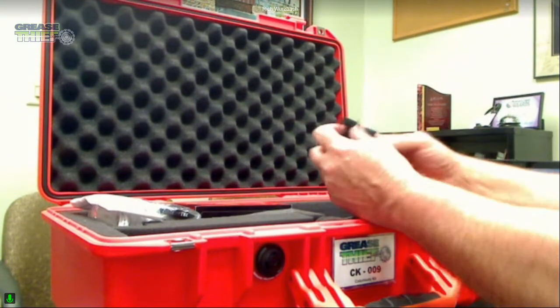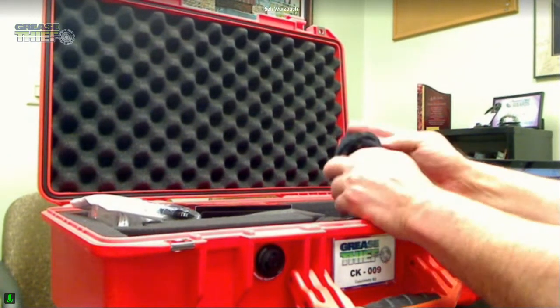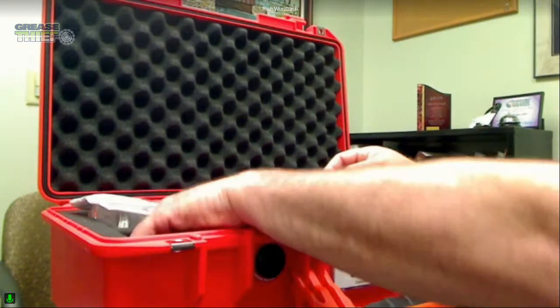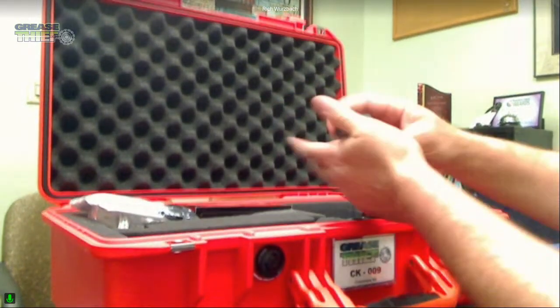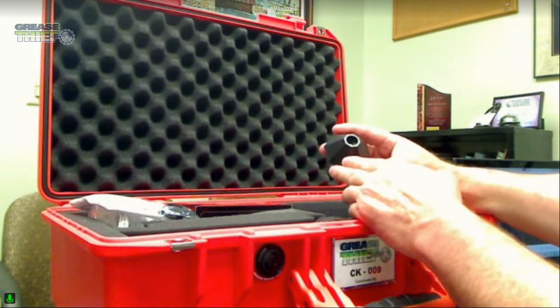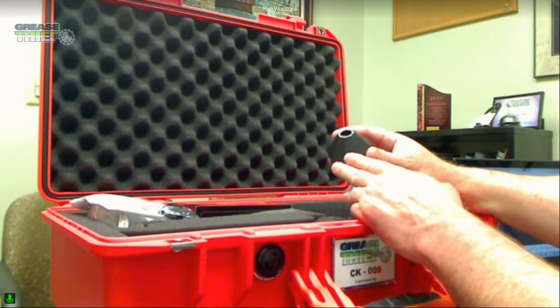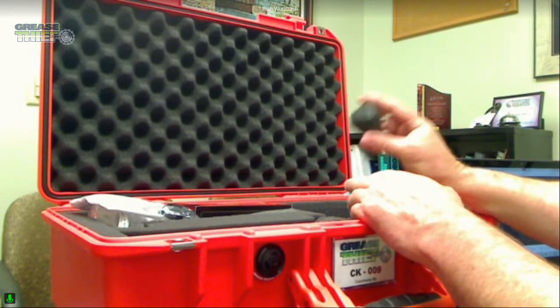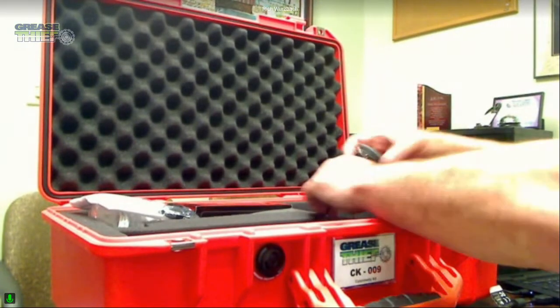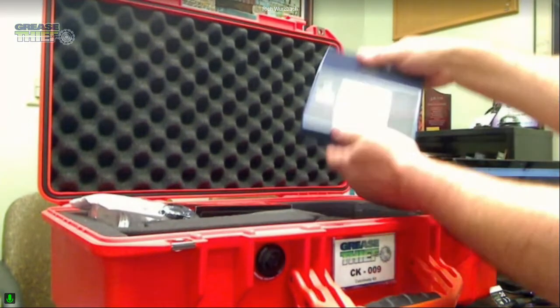So right here is the spectrometer. This is the tool we're going to use. Very robust, but very powerful tool in terms of being able to make a reliable and scientific measurement. And so we've got that here to be able to do that. And then inside here is the FerroQ.